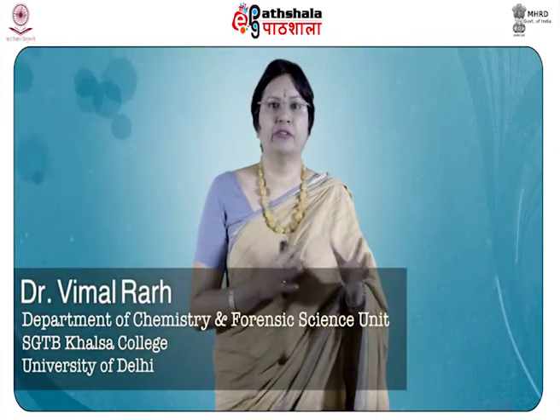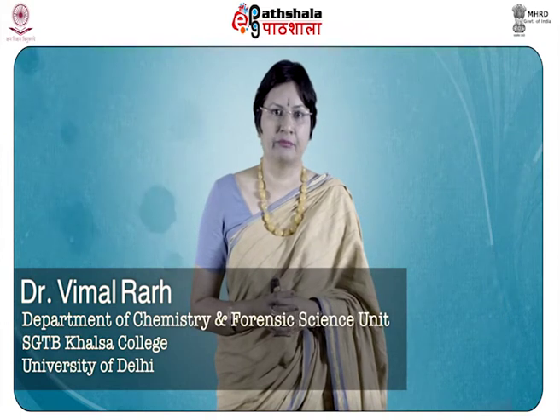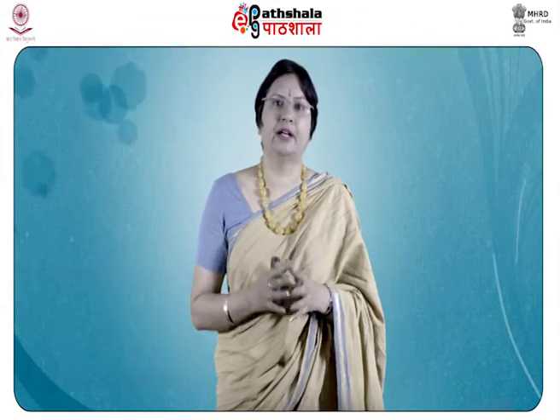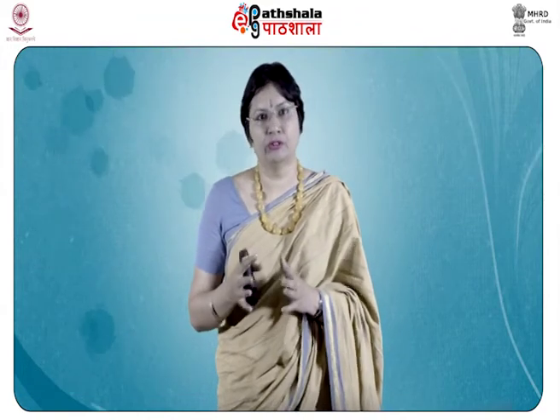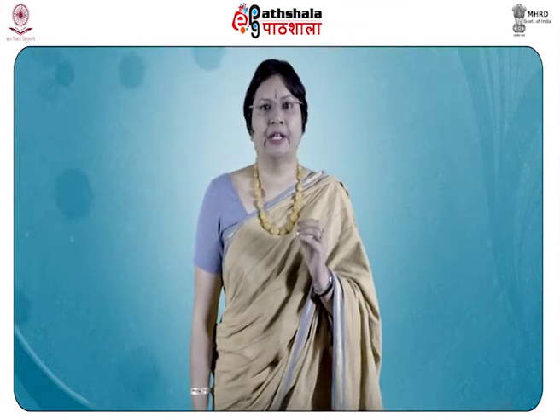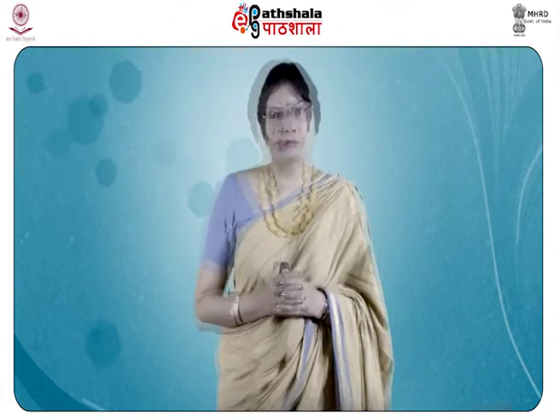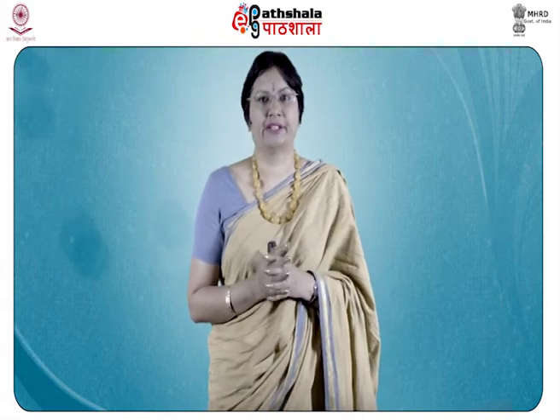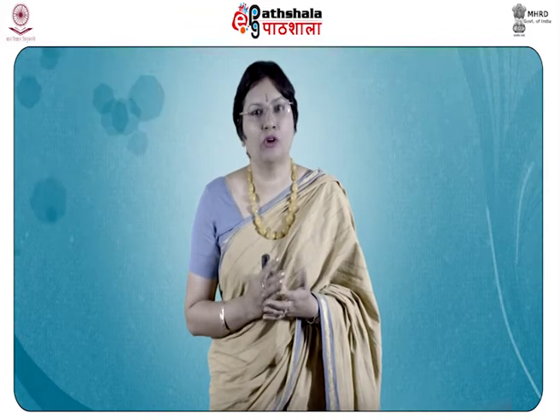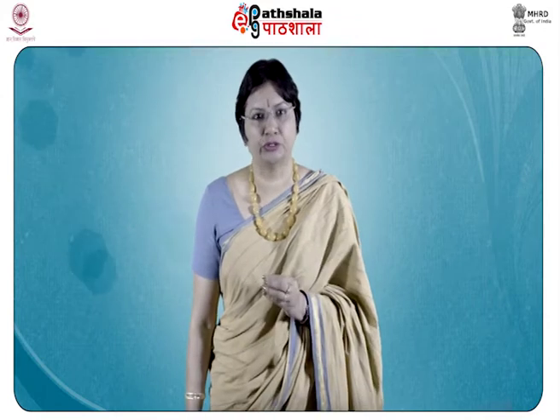You have studied what the various explosives are, their types, and how to manage the crime scene. But when you take this evidence of bombs and other explosive material into the forensic lab, how do you deal with the inorganic anions and cations which are there as components of the material or the evidence that you have collected? So, this module shall focus on the analysis of inorganic anions and cations of the post-blast residues.